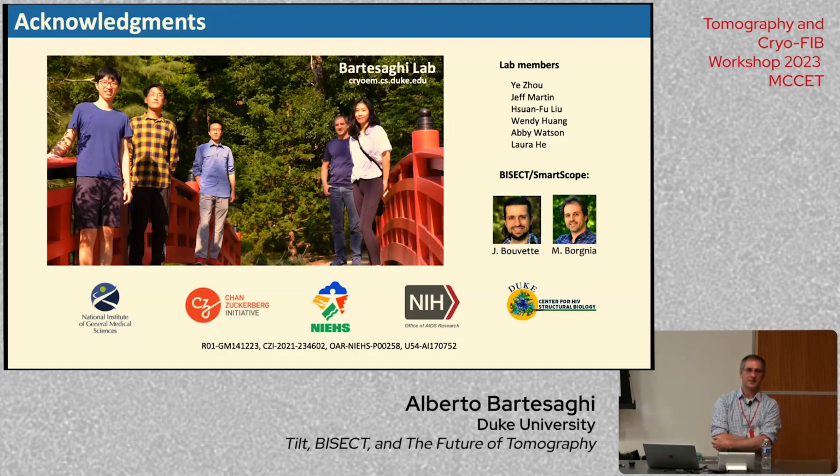Thanks. I have another question. In single particle cryo-EM, the revolution was the direct electron detector, right? So what do you think for tomography will be the main advancement in the next few years? Definitely throughput of data collection, and then scalability in the data processing, right? We need to be in the hundreds of thousands of particles, and then we have tilt series of those. So we have lots and lots of problems to solve with storage and data analysis. Unless we can do that routinely, it's going to be very difficult.